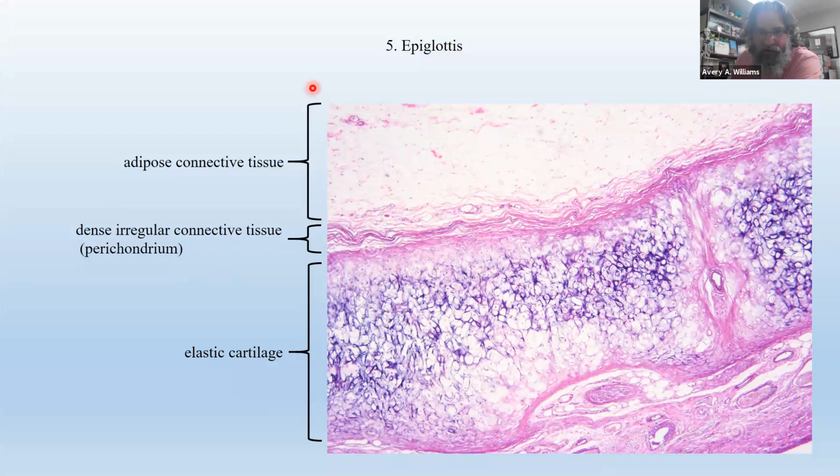And then this next bracket right here, this would be more superficial, going out towards the top or the outside, I guess. And you can barely see, this is the fat layer, so adipose connective tissue. It kind of looks like little rings. There are little adipocytes, little fat cells. You see a few fat cells over here. You have fat anywhere, but this is a very distinct layer right here. You can tell it's something different. This is different than this, and this is different than this, and so on and so forth.